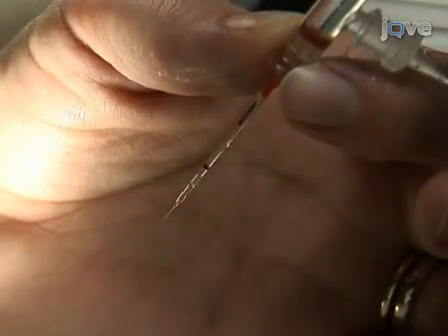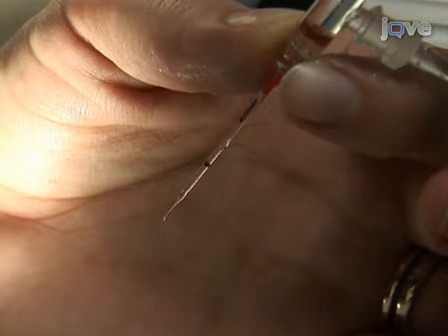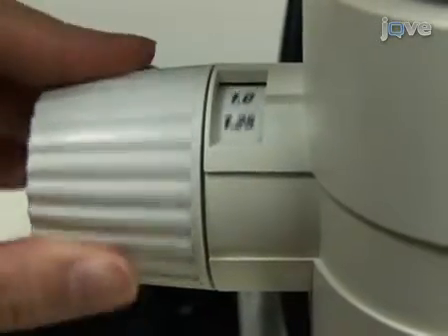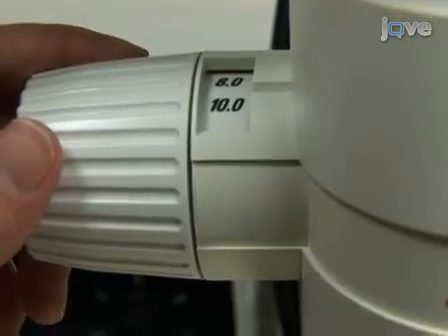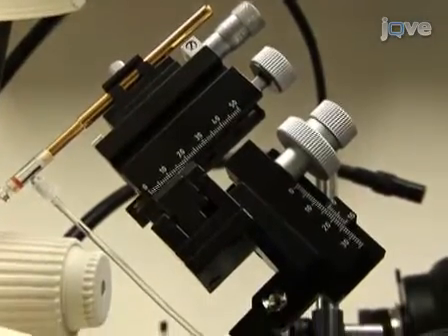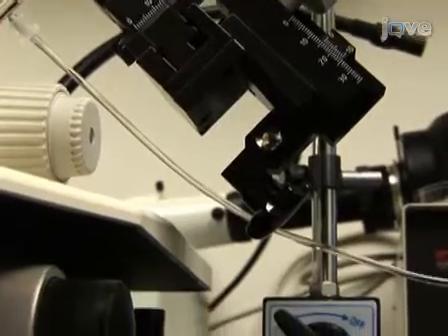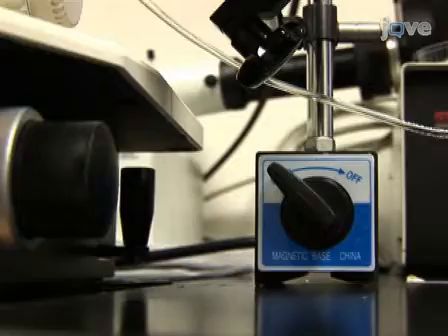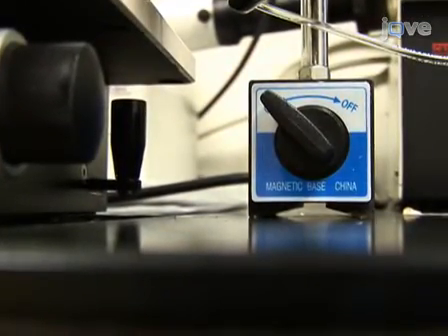Eliminate all air bubbles from the system, as they will ruin your ability to control the suction and pressure. Use a stereo microscope that has high-quality optics of at least 80x magnification. To control the positioning of the micropipette holder and needle, we suggest a Narashige manual micromanipulator. Be sure it is fixed to the bench using a magnetic base to prevent vibrations from transferring to the transplant needle.